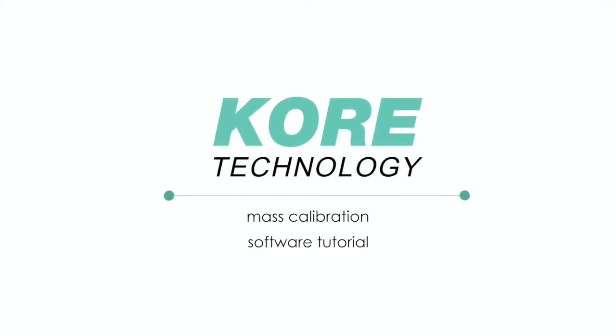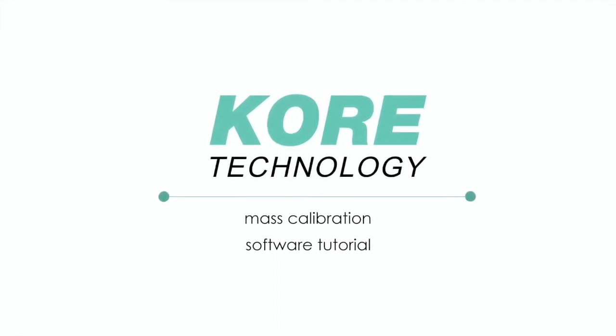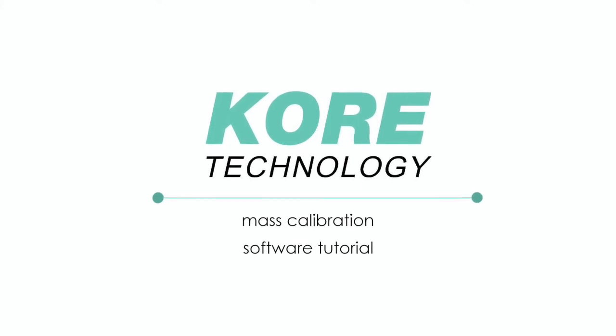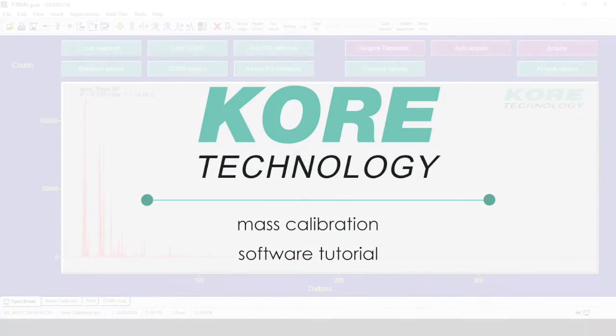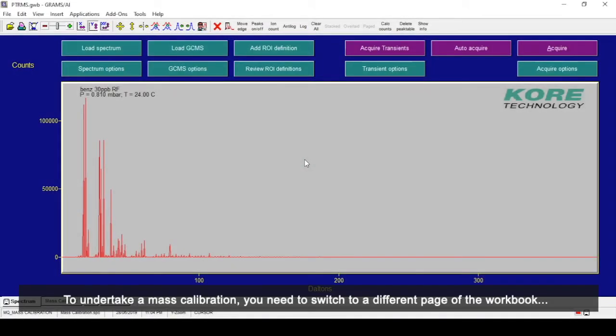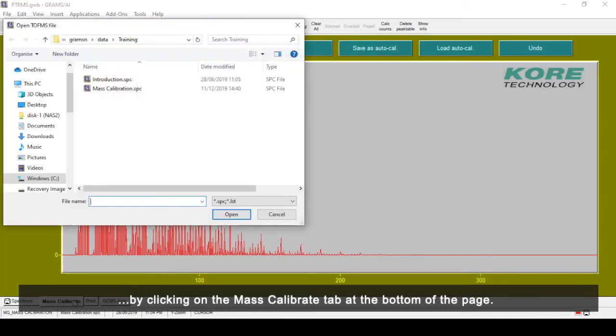Hello, and welcome to this core technology software tutorial, where we will be learning how to correctly mass calibrate a spectrum using the tof-ms acquisition software. To undertake a mass calibration, you need to switch to a different page of the workbook by clicking on the Mass Calibrate tab at the bottom of the page.